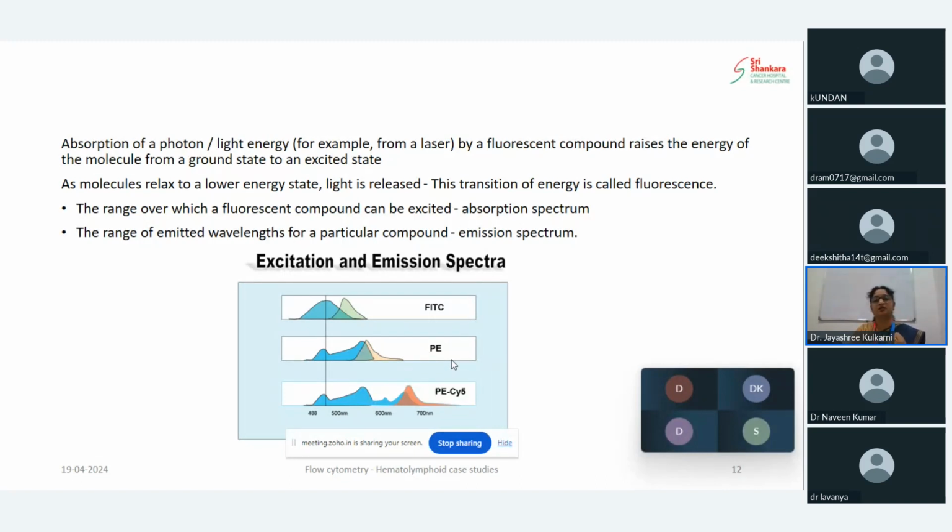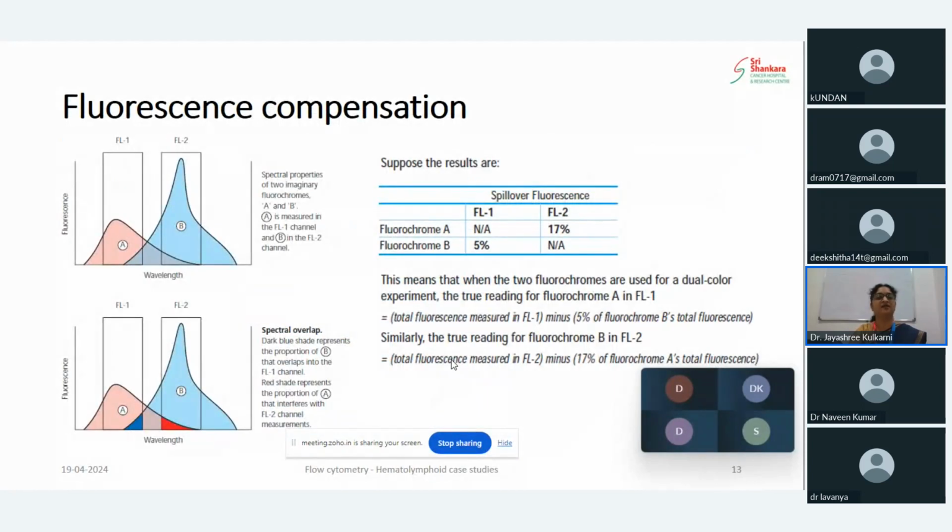Along with that, since you're looking at leukemias, you need to have your immaturity markers, say CD34. So in every tube, you already have 2 antibodies. You can accommodate only 3 more, which are lineage specific markers, say for myeloid or B tube or the T tube. So you used to have multiple tubes. Now with increasing channels, in one tube itself, you can fit in multiple antibodies of various lineages and you can have your diagnosis much easier.